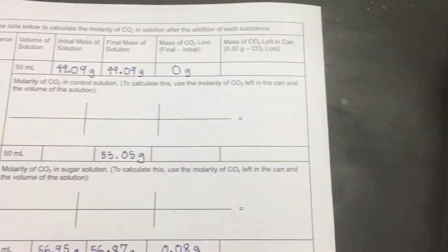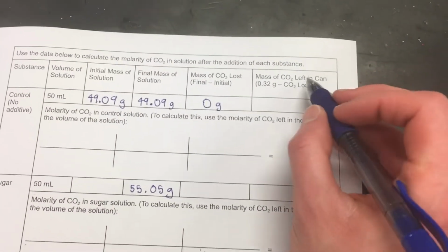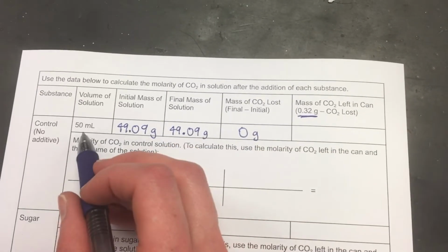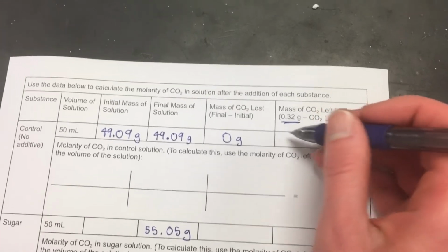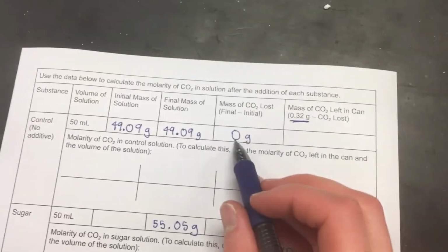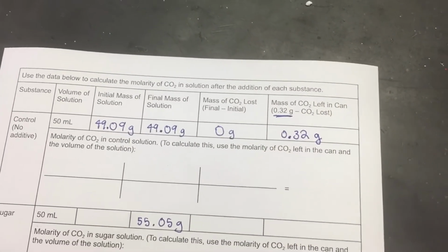So then what we can do is figure out how much CO2 is left in, not the can, but the beaker. I calculated this on my own: there's going to be about 0.32 grams of CO2 in every 50 milliliters. So basically each of these beakers started out with about 0.32 grams of CO2. Since this one didn't lose any CO2, there's still 0.32 grams left in it.